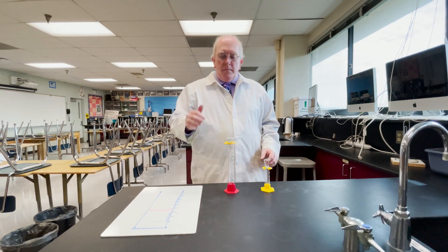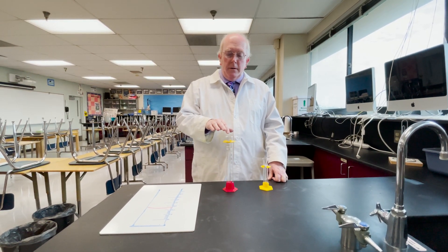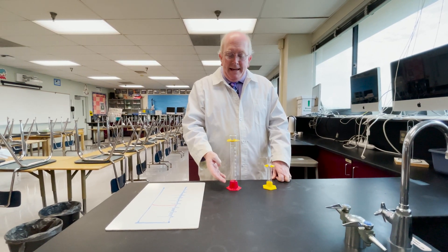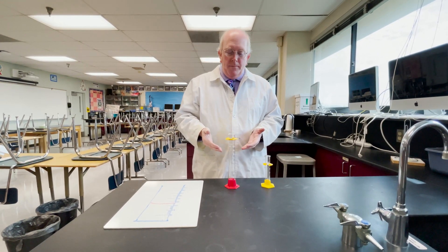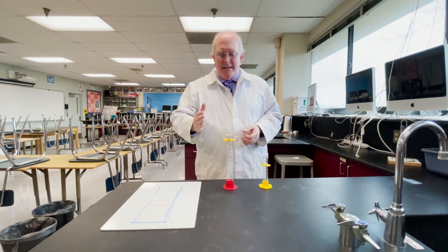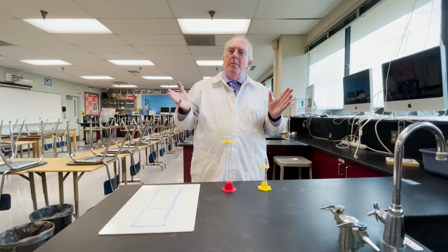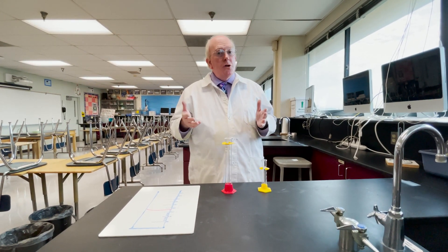When you pour liquid into here, sometimes people use a funnel. You will get water, as an example, forming what is called a meniscus. That is a curve to the liquid, and you see this sometimes even at home in drinking glasses or in a straw.